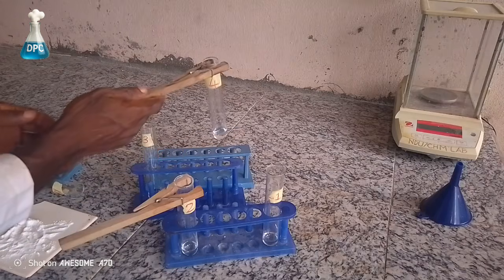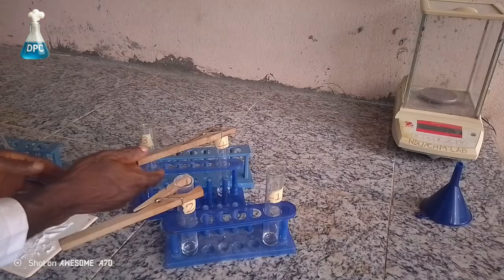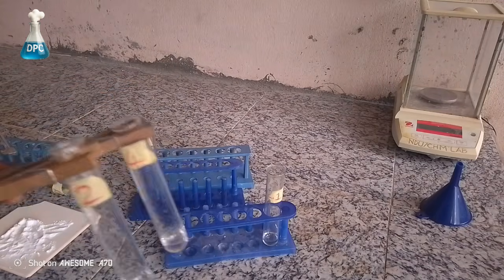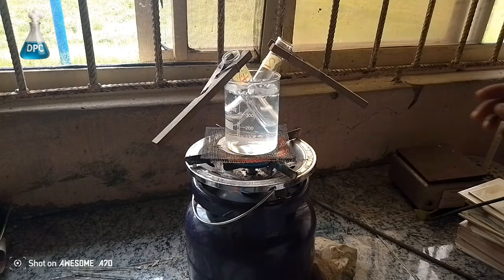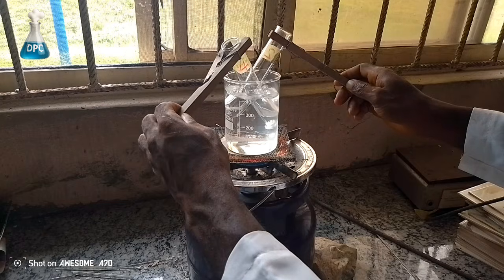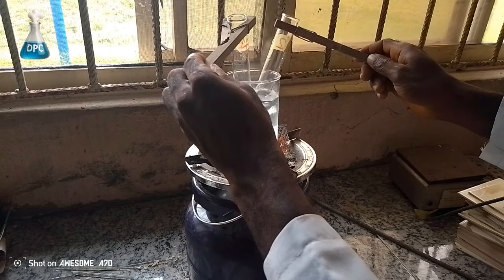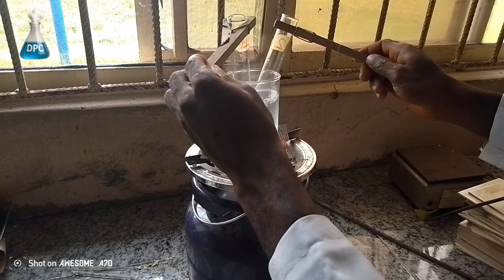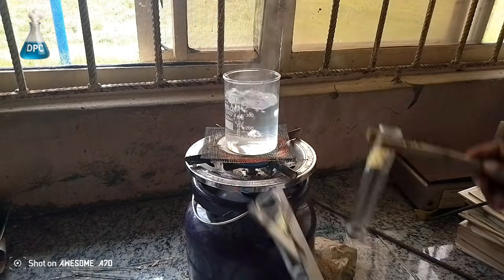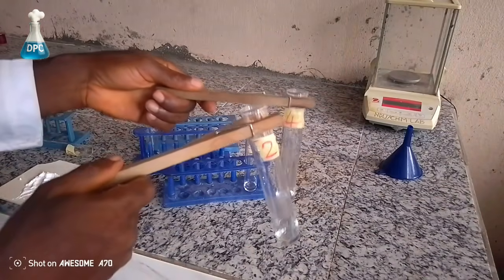Now we heat it to near boiling. Then we react the both of them. Remember, test tube 2 has the acid, test tube 4 has the base. When we heat them near boiling, we react the both of them and then we observe the effervescence, which is the rate of bubbling. Thereafter, we'll react the other pair, test tube 1 and 3, at room temperature. Now observe their reaction.